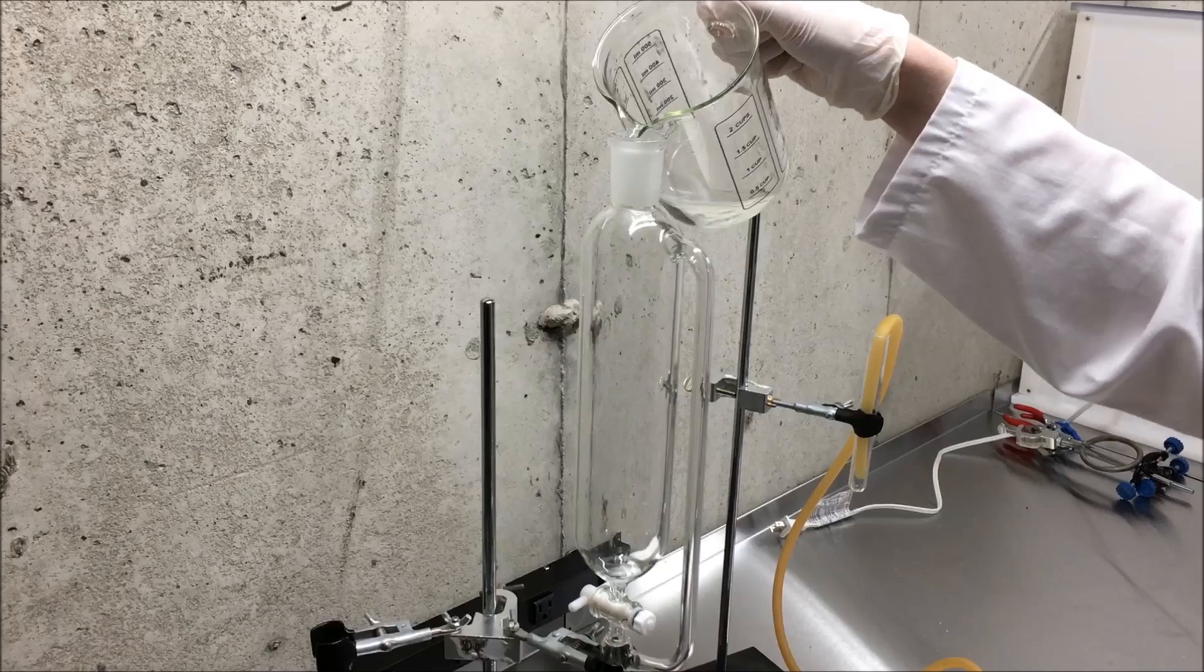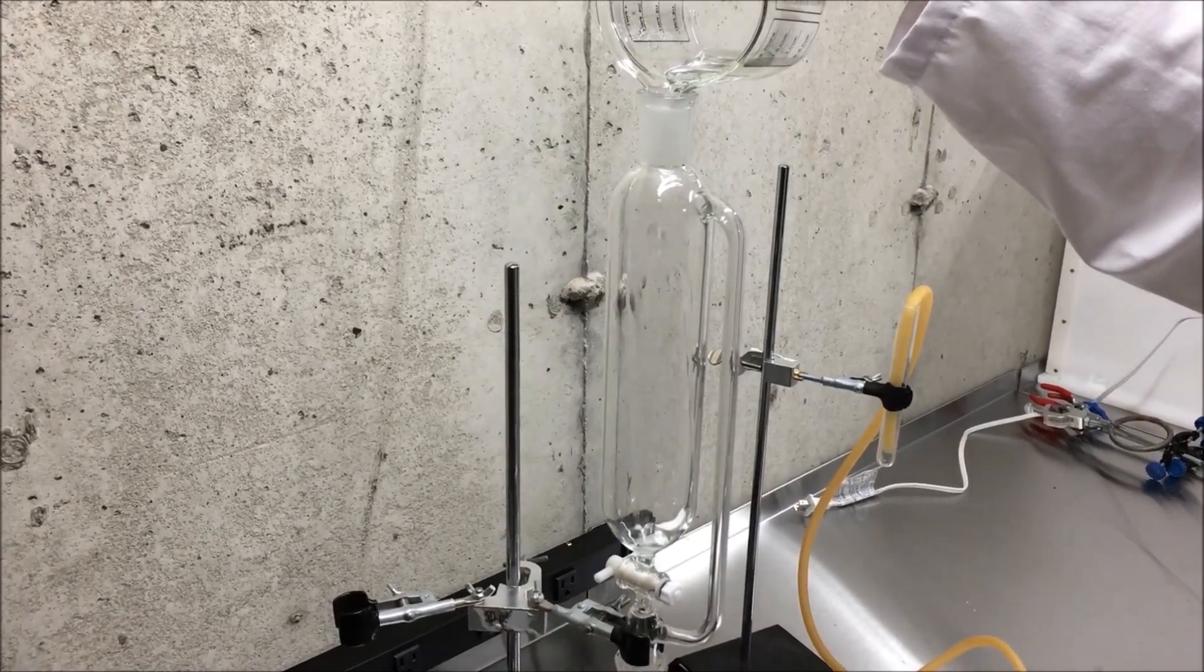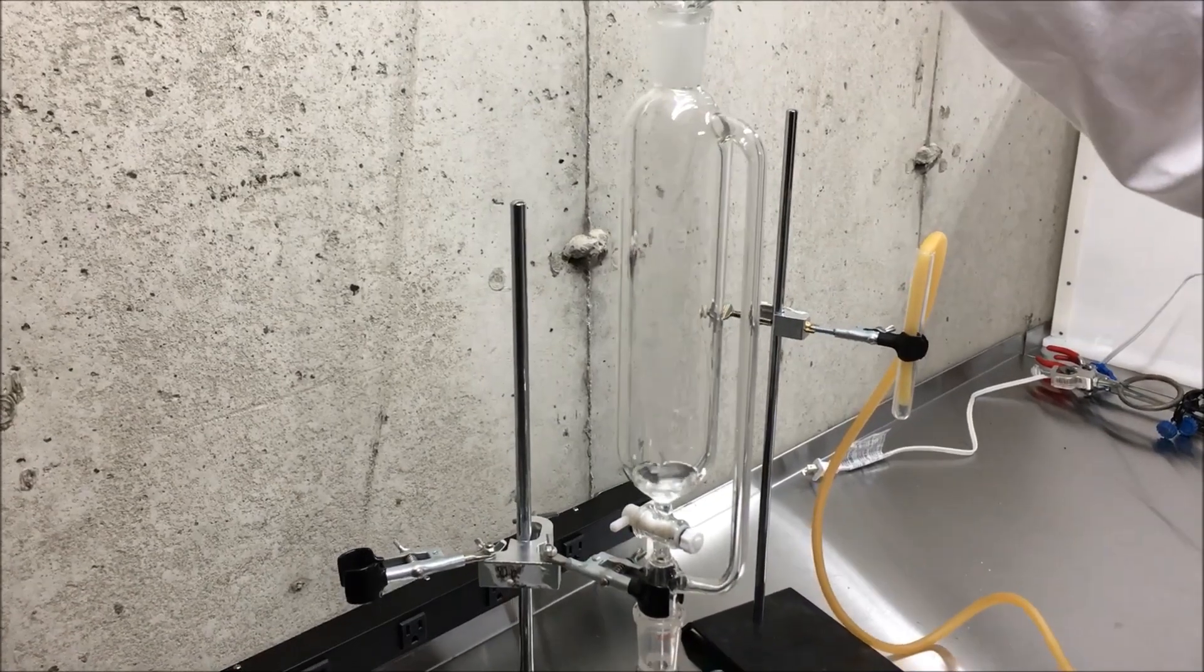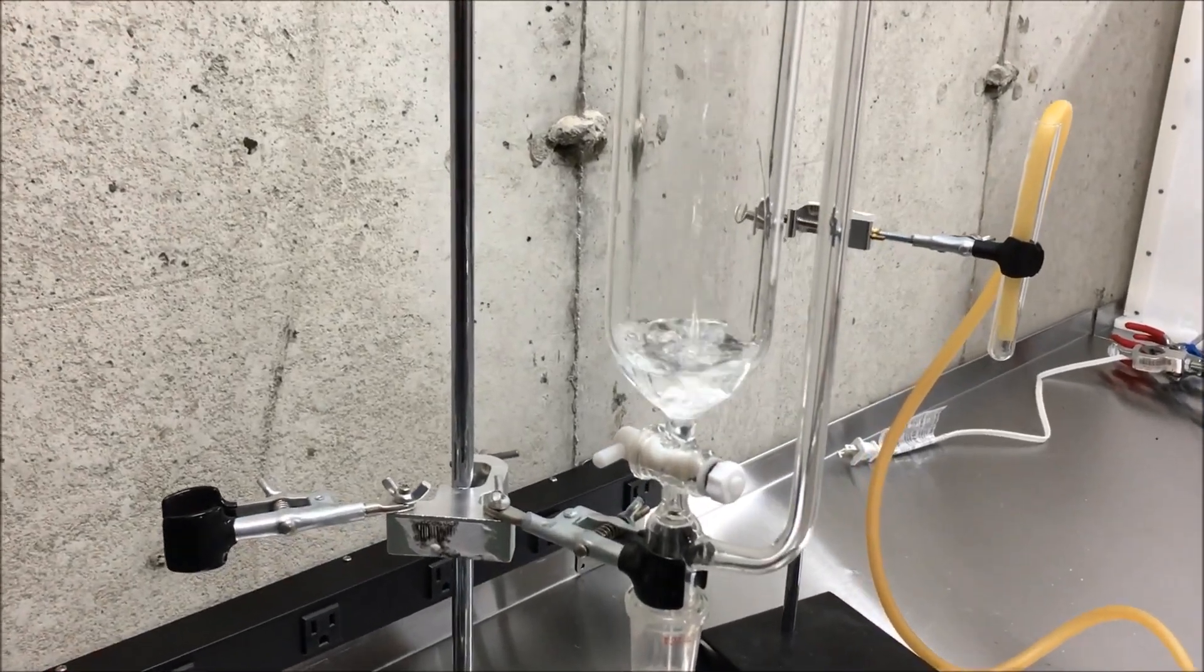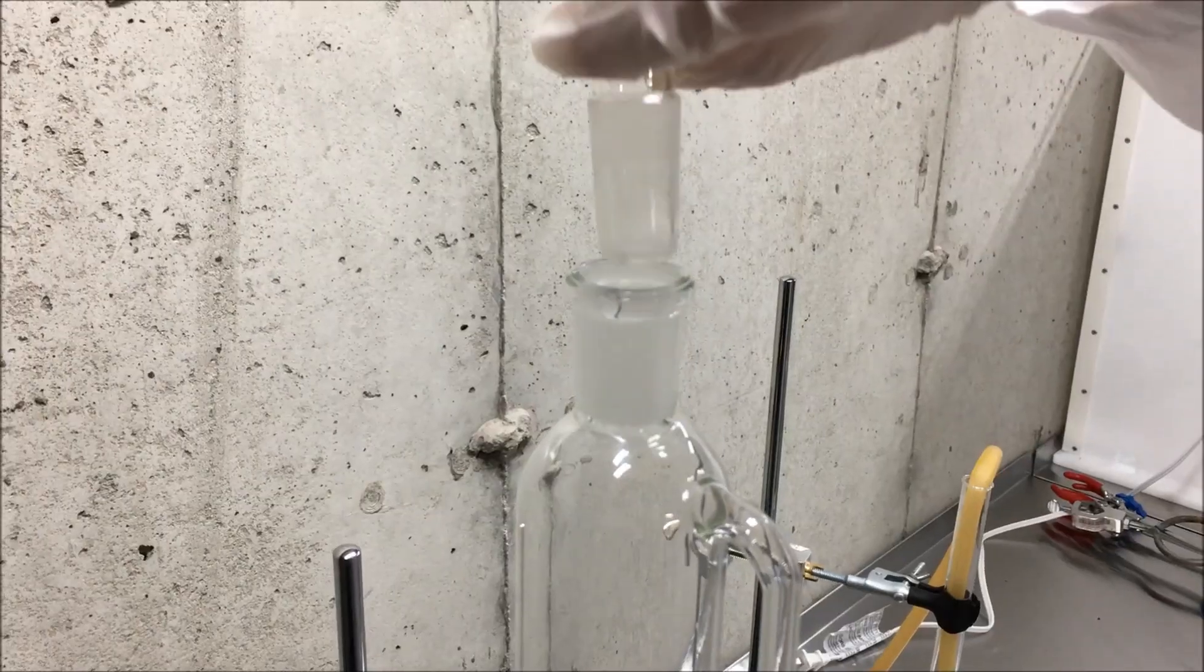I then added around 20 milliliters of around 25% hydrogen peroxide into a pressure-equalized addition funnel. This pressure-equalized part is very important, or else it'll slowly drip through.